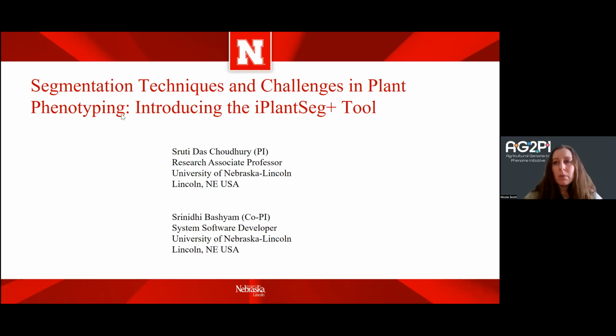Welcome everyone to this agricultural genome to phenome training workshop. This is on the iPlantSeg Plus tool. I should note that this is the product of one of the AG2PI seed grant awards, and the whole AG2PI project is funded by USDA NIFA.